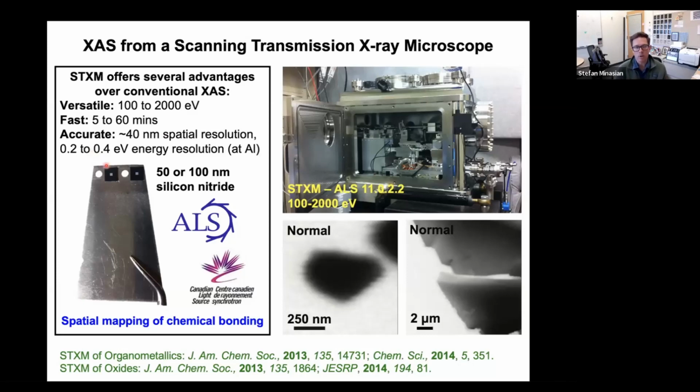What's really advantageous for our work actually comes from how you prepare the samples. We use these aluminum plates, and at the end we mount these little silicon nitride supports. We'll typically apply our sample either by brushing particles on as a fine powder, and you can see a particle here, or by depositing a solution to get crystals to form on the substrate itself. Then we'll attach a second window and seal all those edges up with epoxy. This provides a really nice barrier to the air and also some containment for radioactive samples.